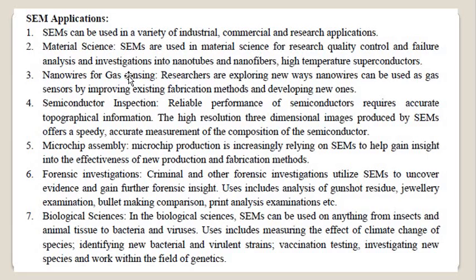Then nanowires for gas sensing. In research, researchers are exploiting new ways, that is, nanowires can be used as gas sensors by improving the existing fabrication methods and developing new ones. So in that field also, that is in the field of nanowires for gas sensing, the SEM can be used. Then semiconductor inspection.